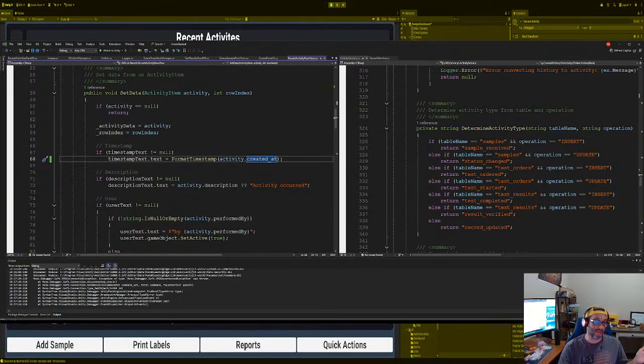We got the recent activities, which is a day ago. Hey, I looked at this sample. This has been there for like 10 days. Hey, who's doing this? And you can see the user is responsible for it and the barcode and all that. All right, and now we're gonna go to the queue, and the quick action is done.